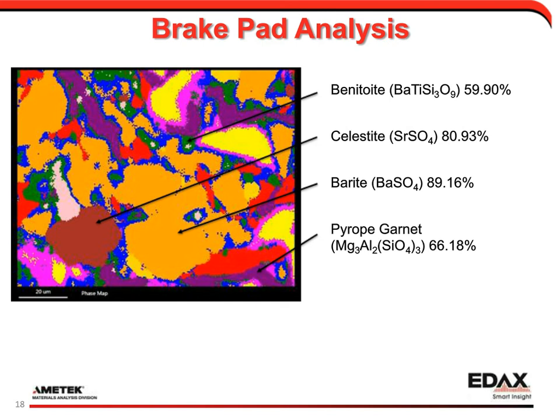This spectrum was, my match spectrum, I do know how it's bound. My match spectrum in the library was acquired from a mineral standard. So this is one of the typically NIST-approved standards where you know the exact composition of the element in there. So I go in and acquire a spectrum from the sample that I know is a pyrope garnet. I know the exact composition. So I know this is the exact spectrum from a pyrope garnet with this chemical composition. I then use that as an input parameter in my match routine.